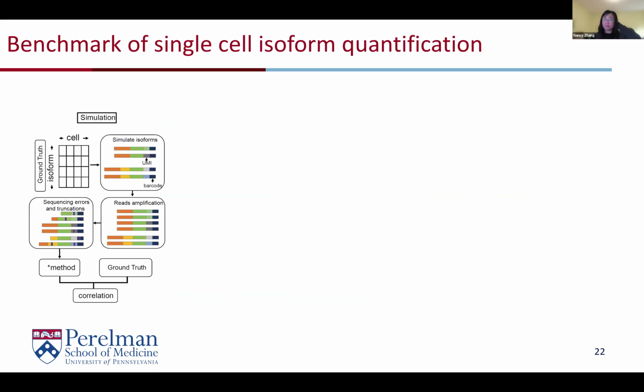So I'm going to show you some benchmarks. First, we did a lot of simulations. In simulations, you know exactly what is the expression level at the isoform level. So we simulated, this is a pretty complicated procedure.